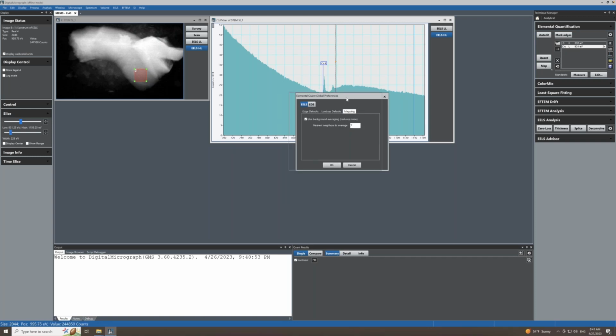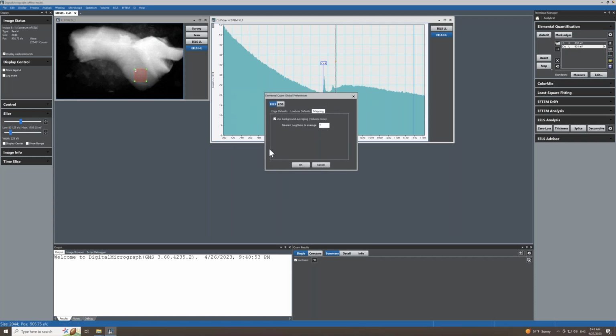Yeah. So typically we do some background smoothing around each pixel to reduce the noise, and by default that's set at 1 pixel, which is relatively minor smoothing. For a more uniform sample that might be more noisy, you can turn up the background smoothing in this region.